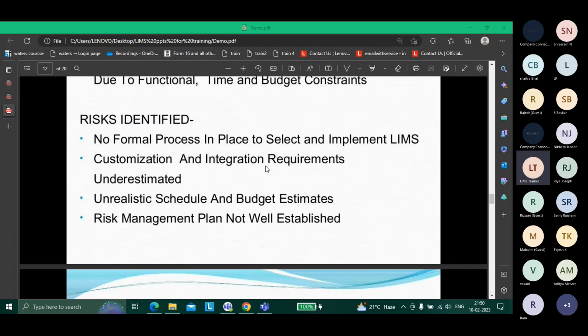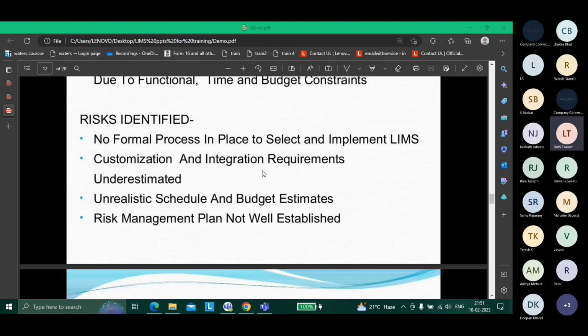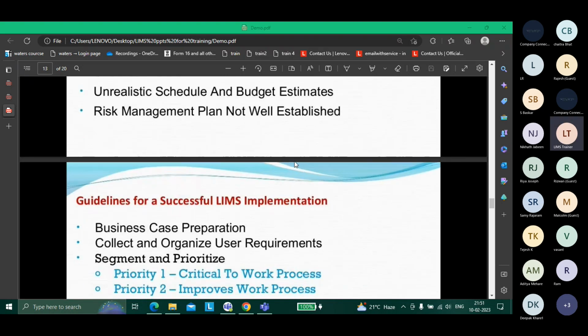The risks, in which programming language it is built, how the creators, how is the track record for providing support when anything goes down, what has been the past review, how is the UI, how is the security, how much does it comply to the pharma industry regulations and standards, how good does it comply, how easy it is to automate certain processes. These are the things.